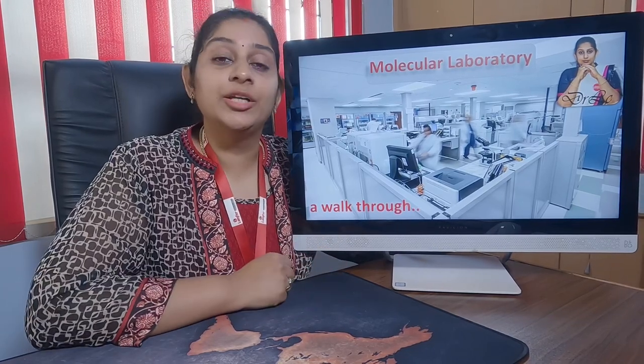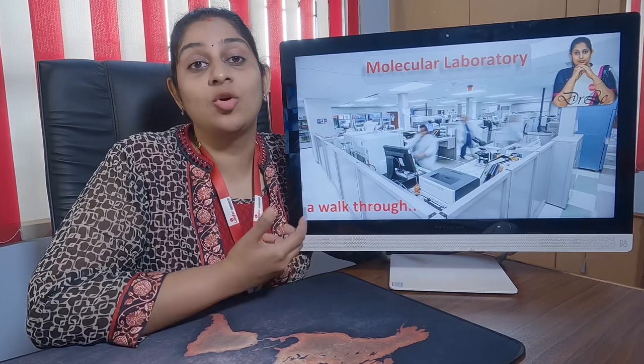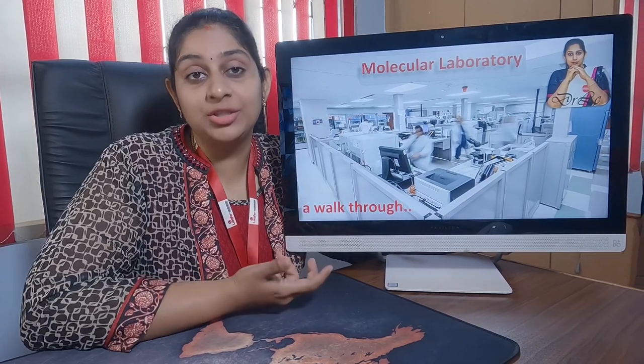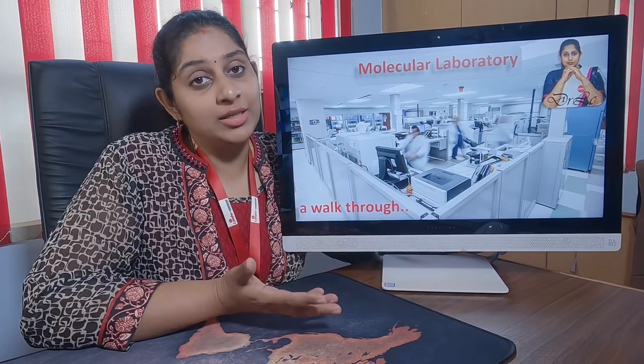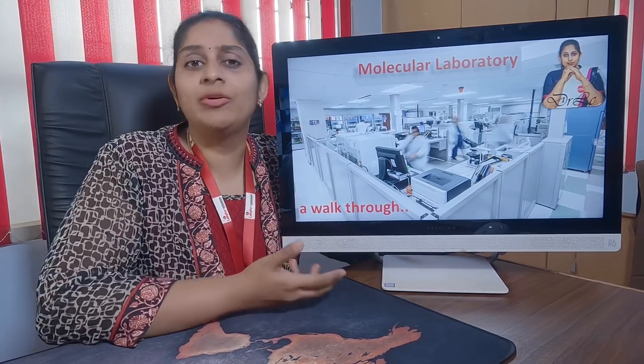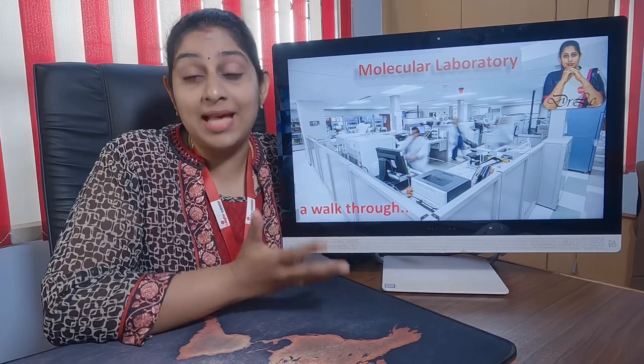In this video, we're going to see how a molecular laboratory is set up, what all its components are, and how we are going to function this molecular laboratory. This basic laboratory of molecular genetics and molecular biology was set up very recently during the pandemic time, mainly for testing the RT PCR COVID samples.